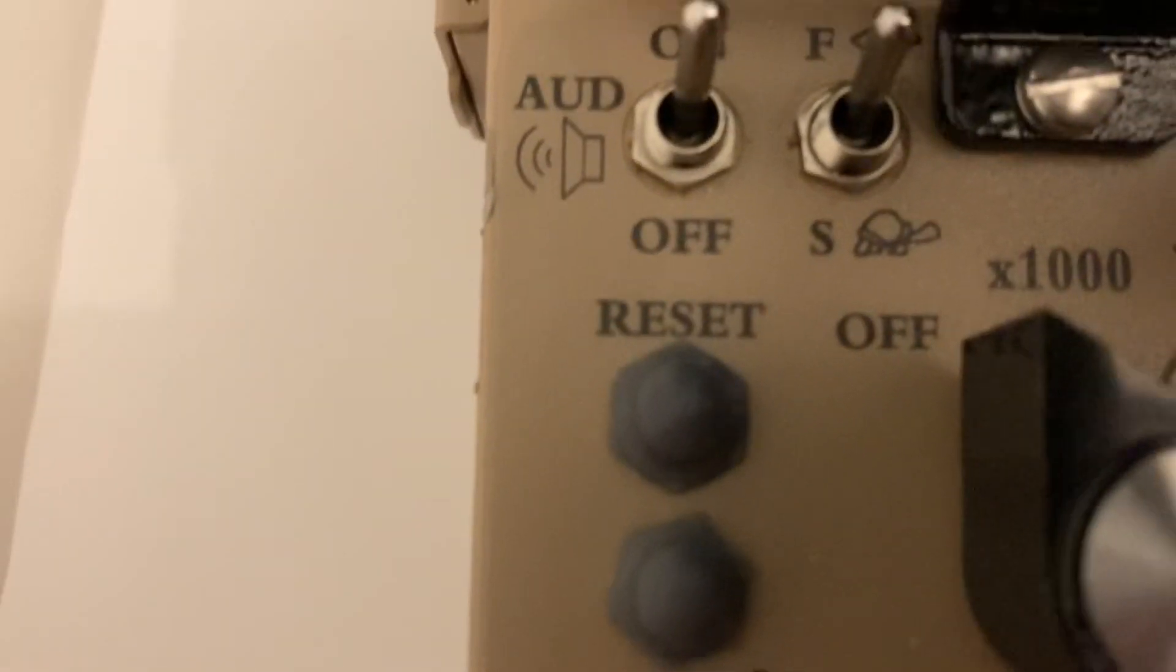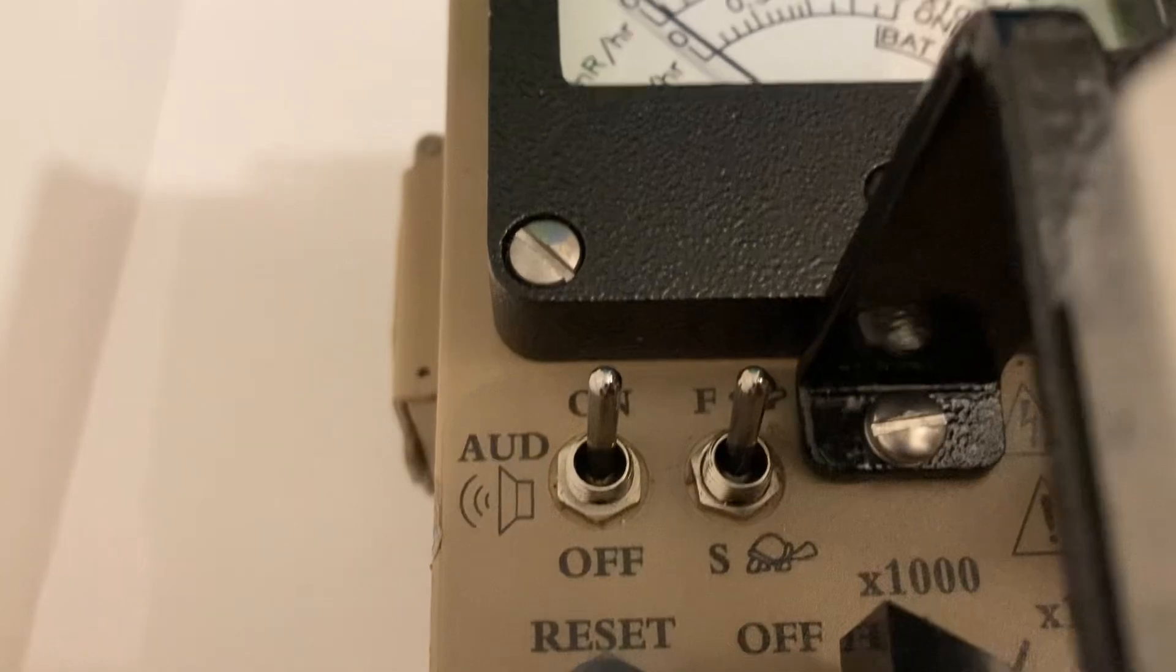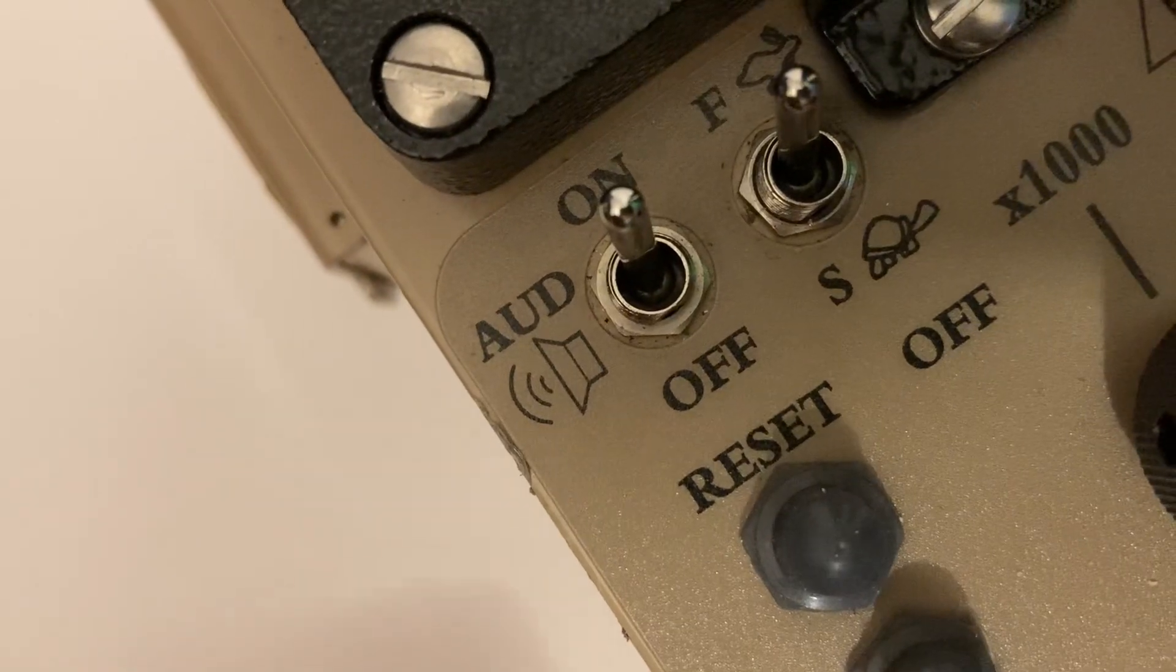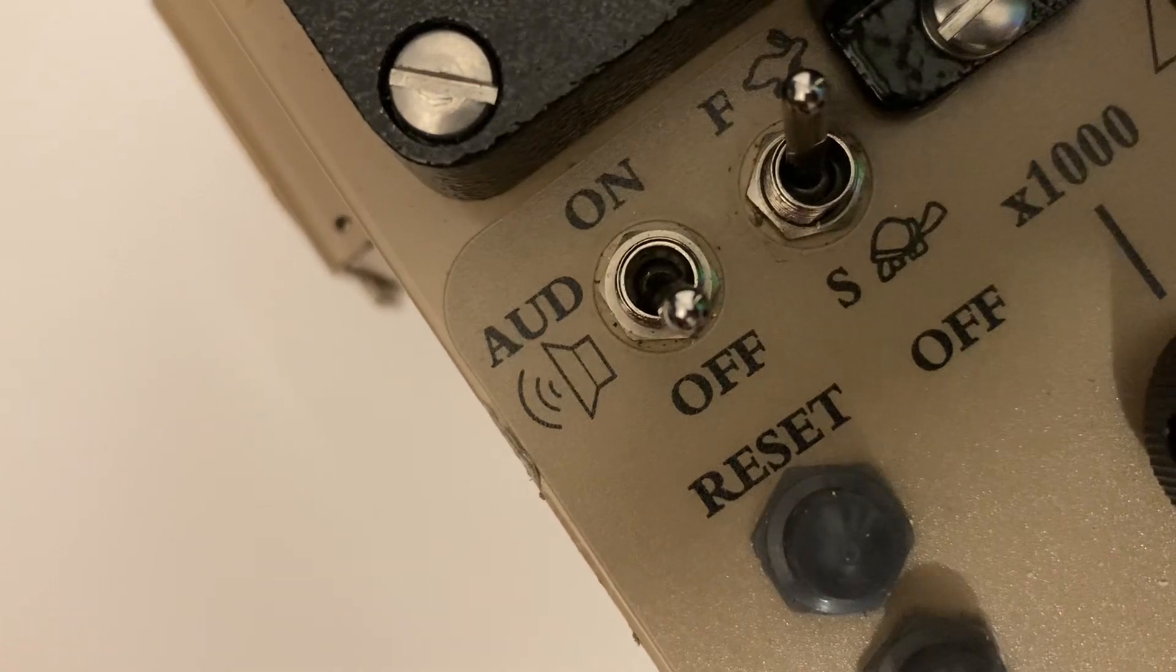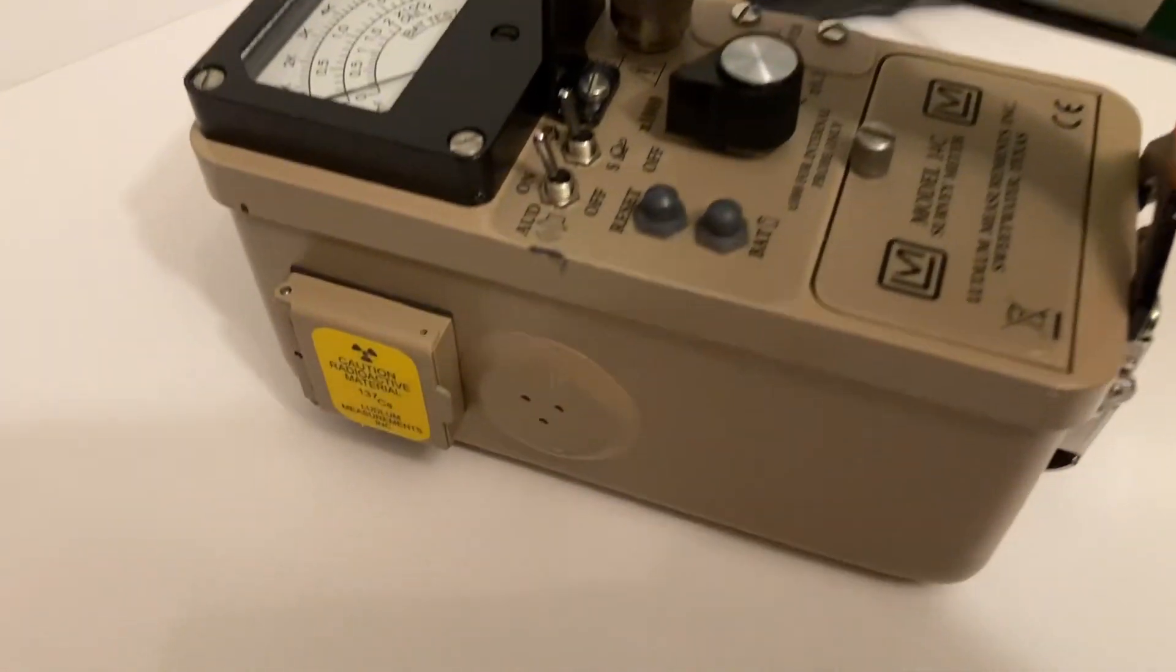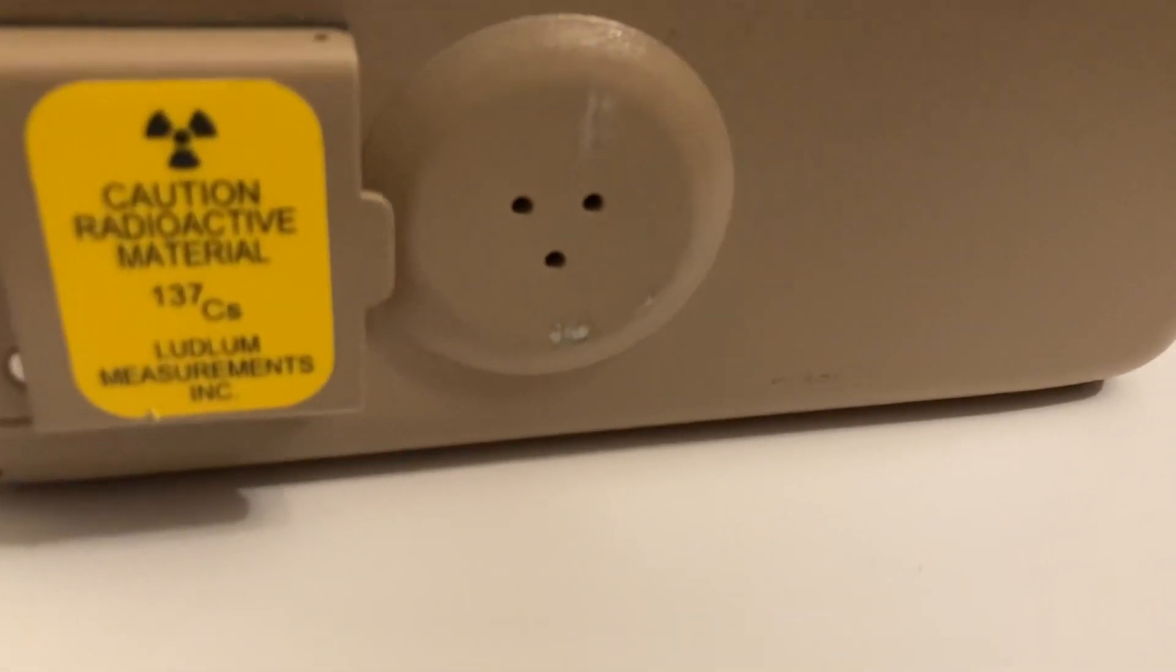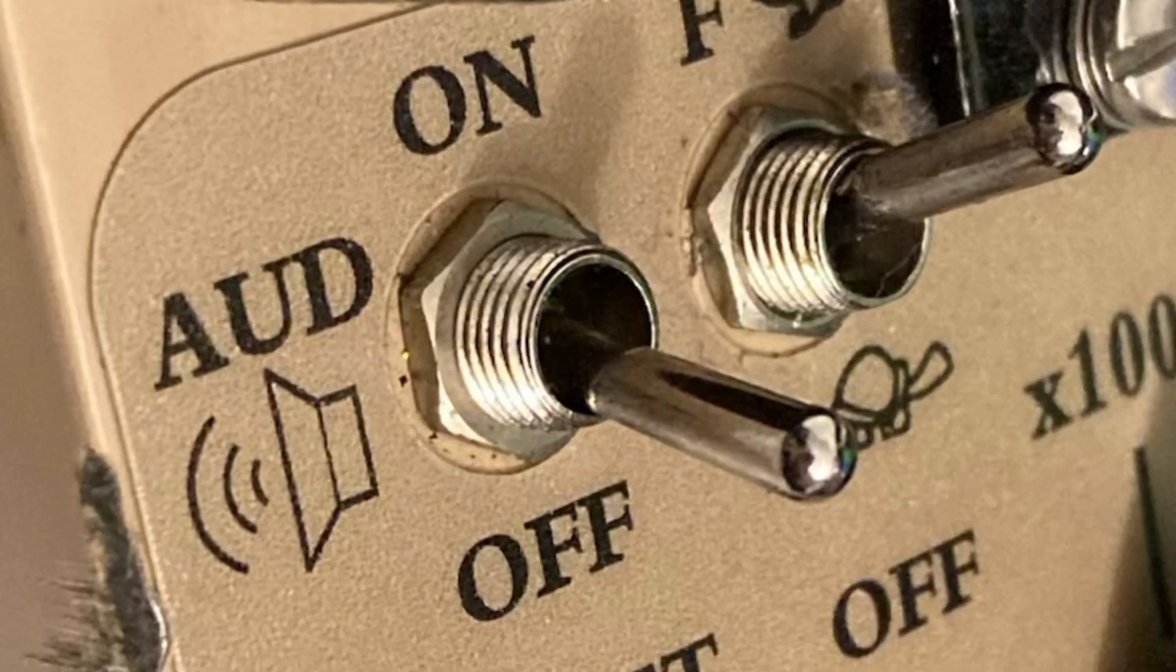Now we'll go over the controls on the instrument. You will see a switch labeled AUD. One position is on, the other position is off. This will turn the speaker on the side of the instrument on or off depending on if you need audio or not. If you don't need audio, make sure to leave the switch in the off position as to not waste the battery of the instrument.